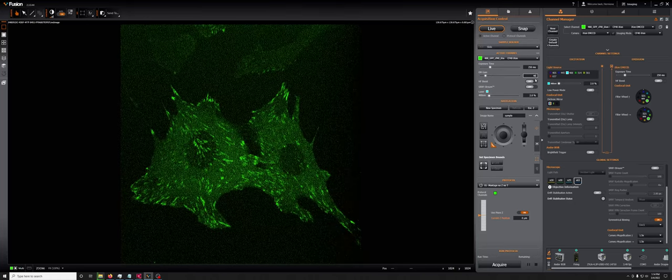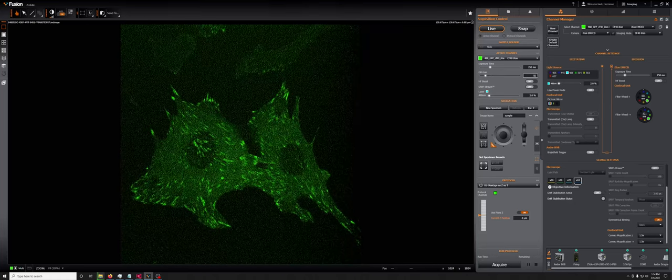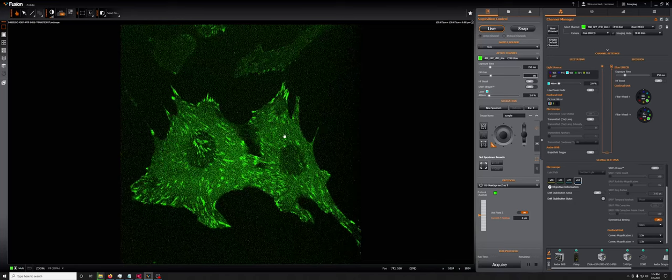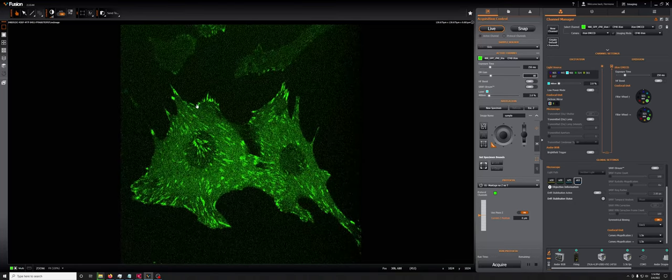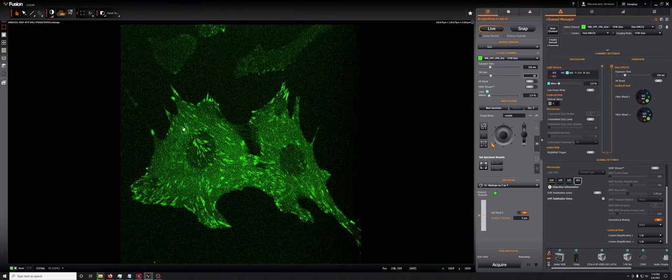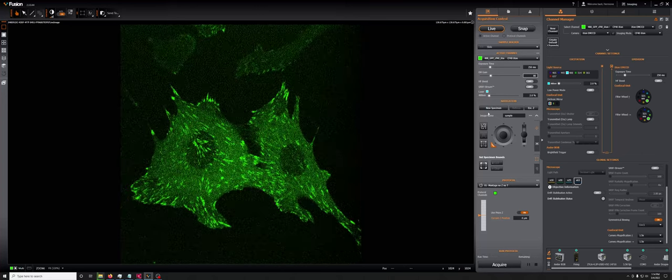You can see between 40 and 80, there is still a noticeable improvement, which you can see as the contrast between these things, which are the real signal and the background.